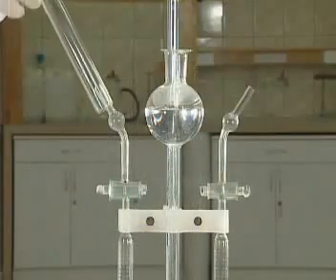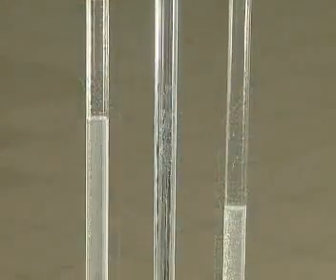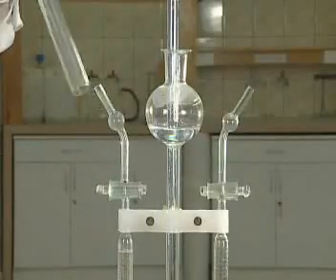To identify the gaseous products of the reaction, we collect each gas in a test tube and check its behaviour in the presence of a glowing splint.